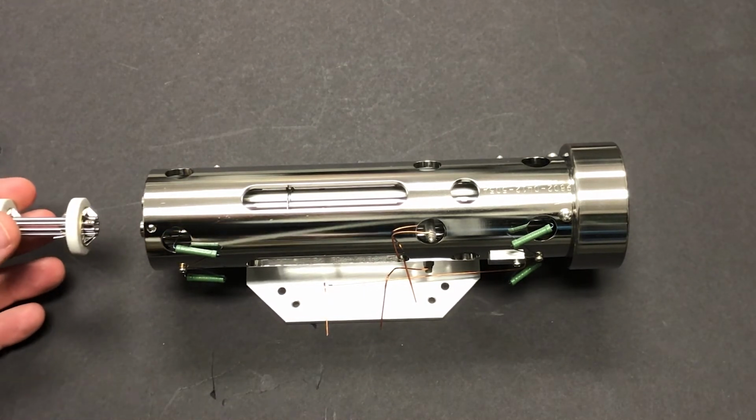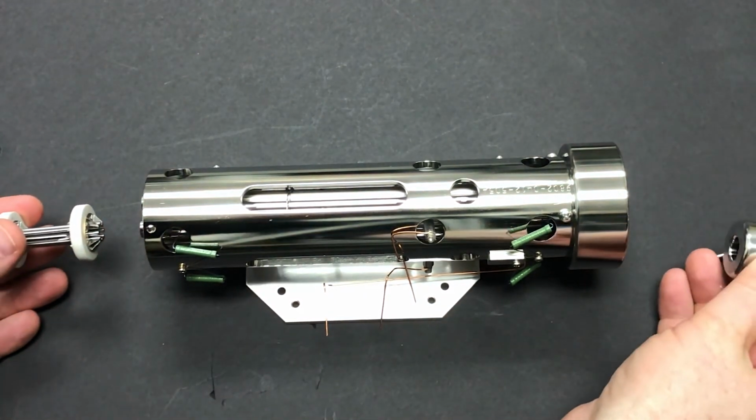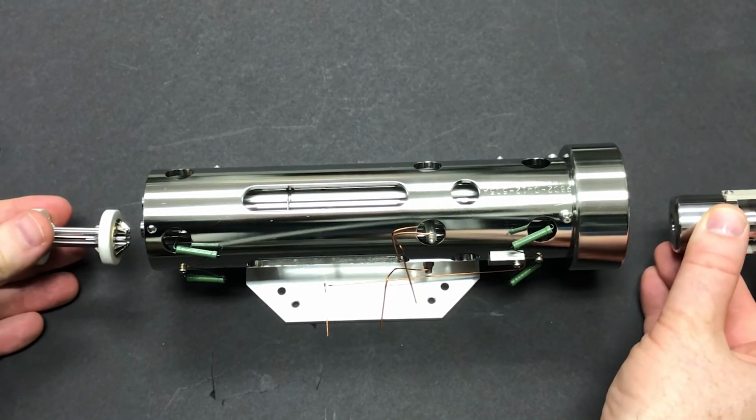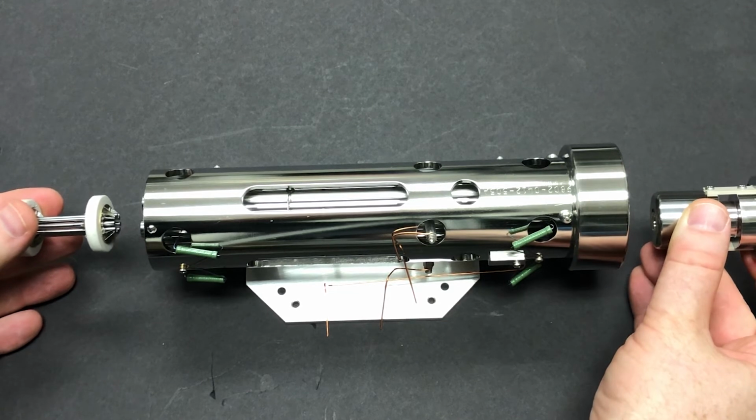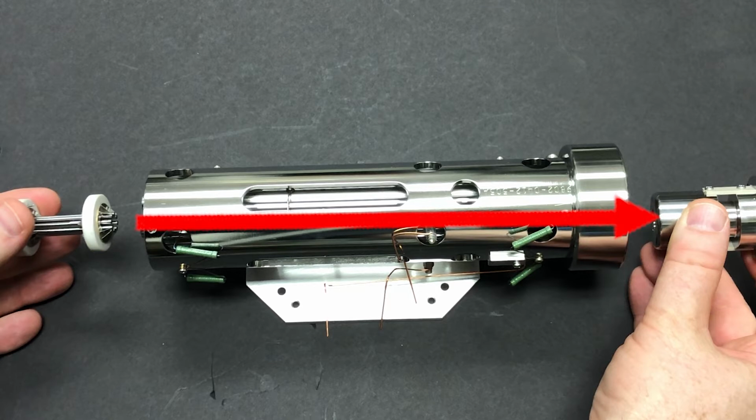We're going to put an ion optic and an octopole ion guide up front, and let's put the electron multiplier in the back. So this is our own very crude schematic. The ions are going to come out of the ion source through the ion optic. Now it's the job of the quadrupole, the mass analyzer, to determine who gets through to hit the detector. So the mass analyzer, the quadrupole, has to give us the x-axis.